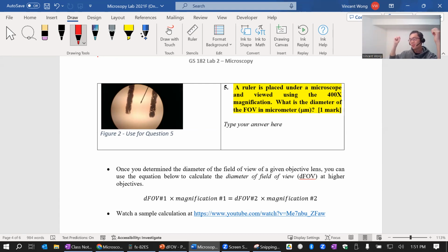Okay. Do you guys understand what this mark is? This is the ruler. This is a marking on the ruler, and this is another marking on the ruler. What's the distance between two lines on the ruler? 1 millimeter, right? So what about here? That is not yet 1, because I don't see the other line yet. But it's more than half, for sure. So that's like 1.7 maybe.